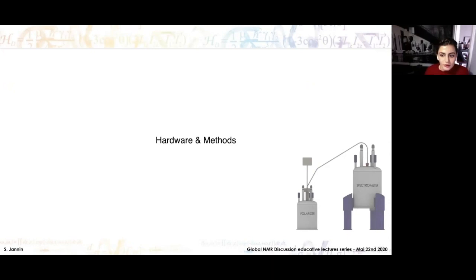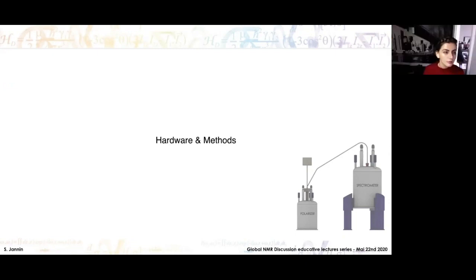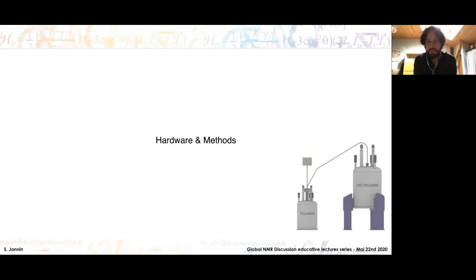And the next one is, what is the typical recording time of the solution spectra, and what is the range of nuclear T1 relaxation? So the range is the same range as the T1 of the nuclear spins when they're not hyperpolarized. So for protons it is around a second. Some isolated protons can have T1s that approach 10 seconds, but it's usually around a few seconds. For carbon-13, it's around 10 to 60 seconds. And for nitrogen-15, it can go up to 10 minutes. Same for lithium, or low gamma nuclear spins tend to have long T1s and are easier to address with dissolution DNP.